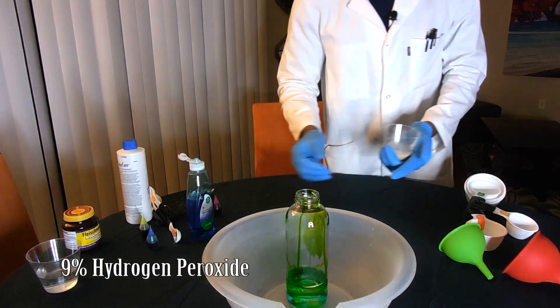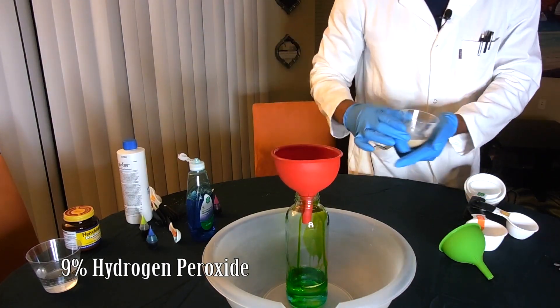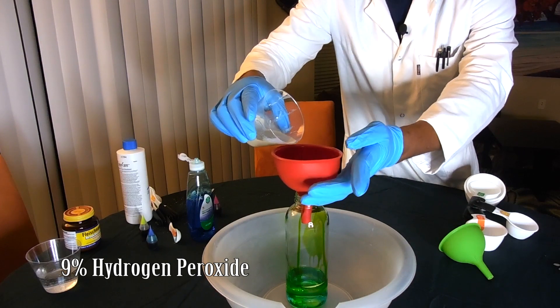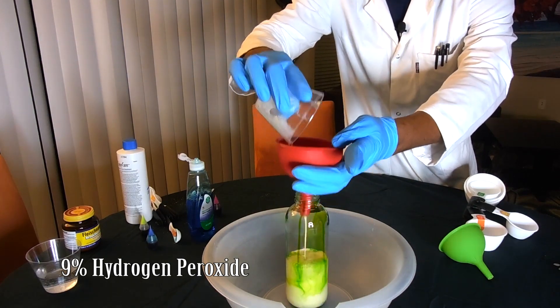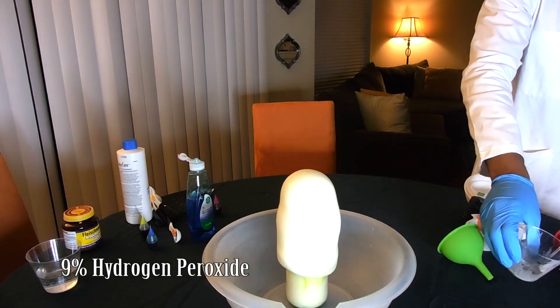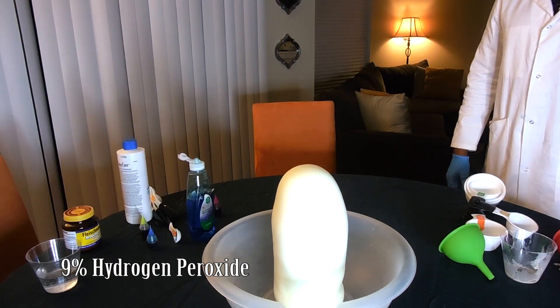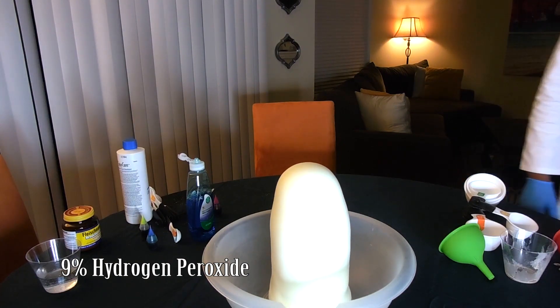One thing I learned by doing this reaction several times: if the container is level and flat, at these peroxide concentrations the reaction will look more like an elephant ice cream cone or snow cone than elephant toothpaste. But if you tilt the reaction vessel just slightly, the reaction will exit the container and look like toothpaste being squeezed out of a bottle.